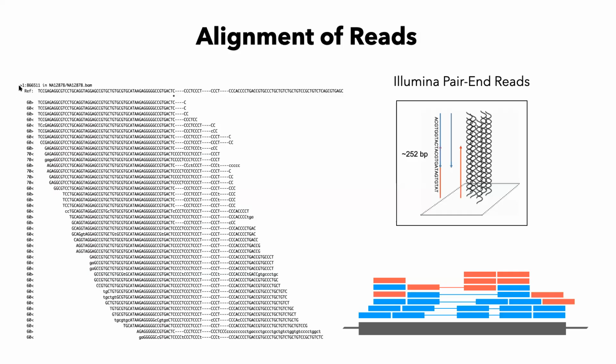These reads are aligned. Okay, so here you can see reads are aligned. And once they are aligned, this alignment is called a BAM file. Again, there are two formats, BAM and SAM. So the BAM file and the SAM file contain the exact same information. That information is exactly the position of the read, where it is aligned, and how does it align to the reference genome. Kind of like multiple sequence alignment, but instead of aligning multiple sequences to each other, it is just aligning of the reads to the reference genome, okay?